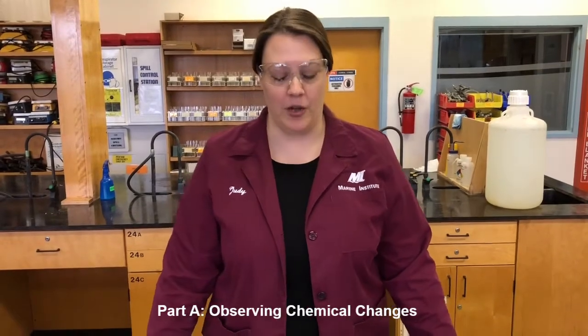Everyone, it's Judy here again, and today we're looking at experiment 2 in Chemistry 1100, which is entitled Chemical Changes and Identification of a Substance. So we're going to start with looking at chemical changes here in this first video.